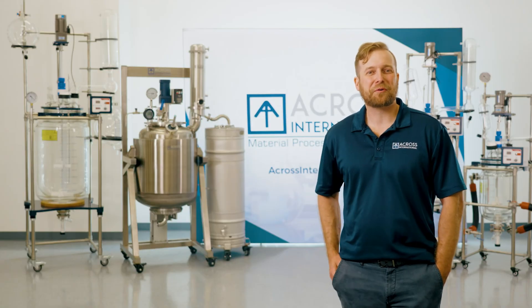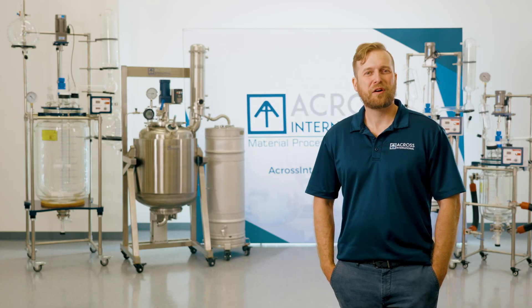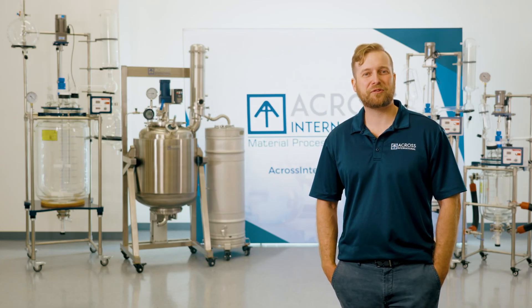Conversions and formulations. Reactor applications are unlimited and there are many ways to utilize them. For conversions and isomerizations like CBD to delta-8-THC, there is no better platform. Processes as simple as mixing tincture or adding terpenes to distillate can also be achieved in a reactor.